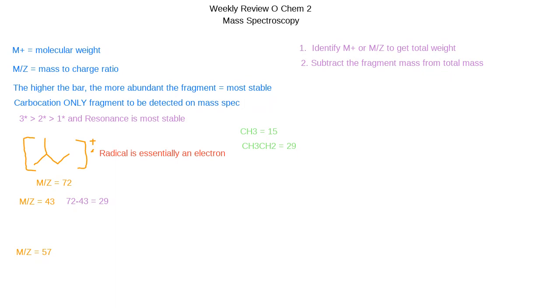Continuing that, methyl, ethyl, propyl is next. CH2, CH2, 29 plus 14 gives you 43. And then if we want to go one more, which we should, methyl, ethyl, propyl, and then lastly butyl gives us 57, okay?